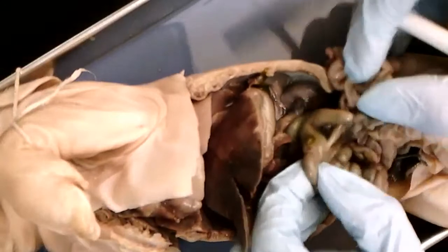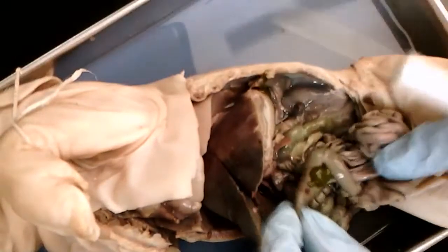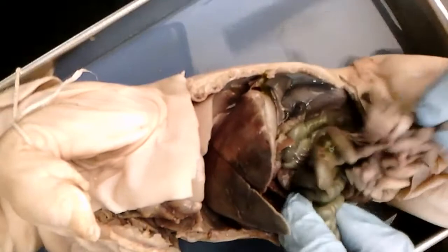I am not seeing it. I think you ruptured the large intestine. I ruptured the large intestine, so we will just move on because we're going to have a mess on our hands. But I did locate the kidneys.